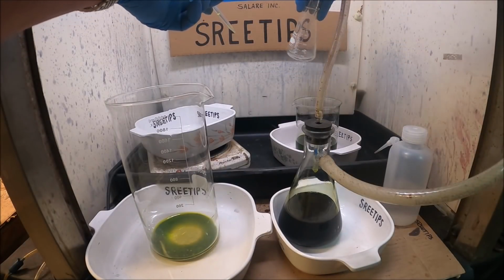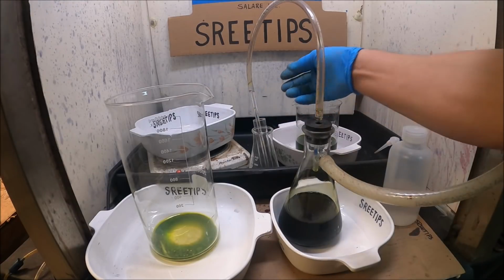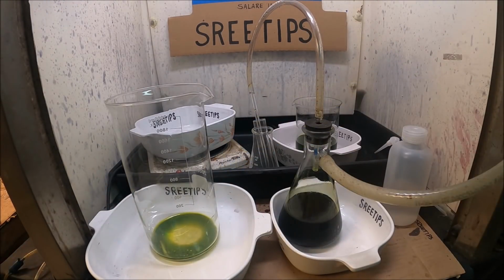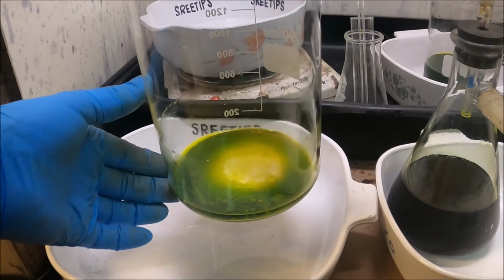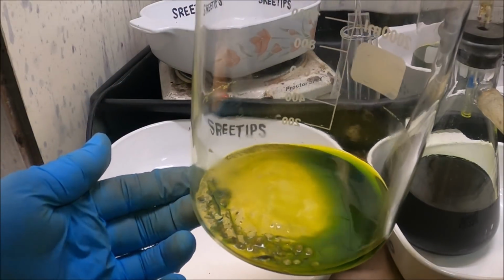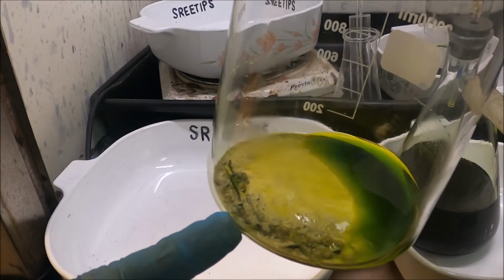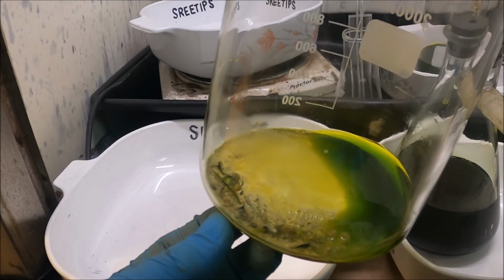All right, we got that drawn off. Now what we'll do here is take a look at what we got in here. It looks like there are some solid pieces still in there. This one looks like it's maybe passivated with silver chloride.